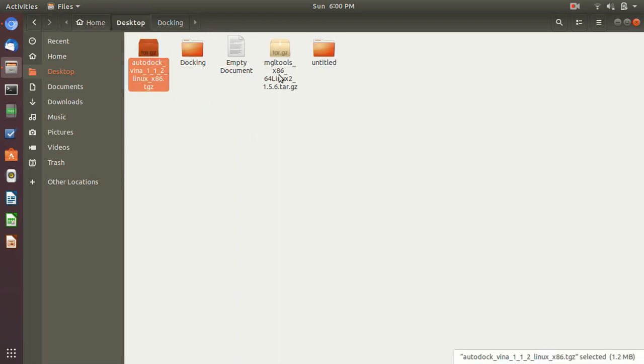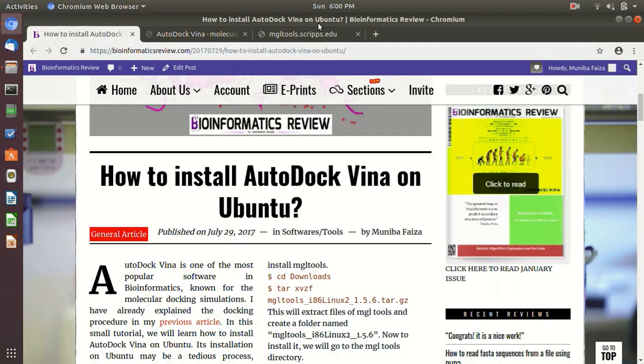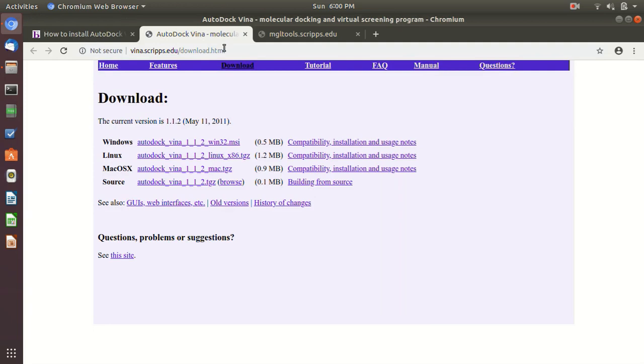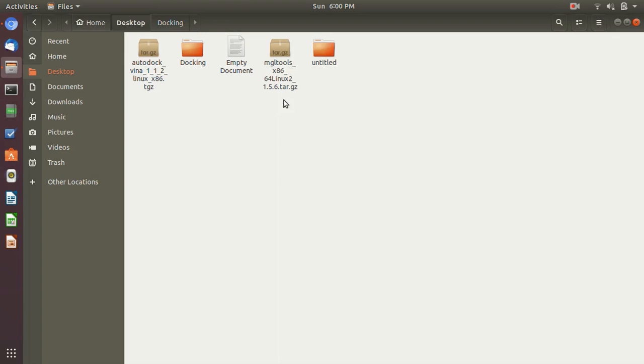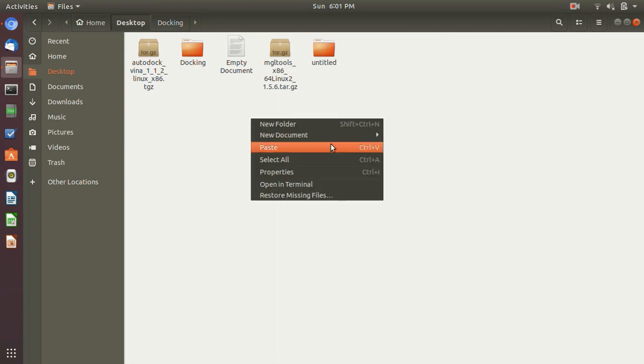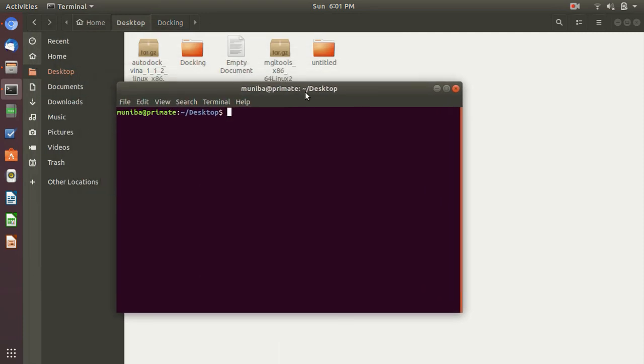So today, let's get started. As you can see here, I have already installed the MGL Tools and AutoDock Vina packages. If you would like to install them, at first you can install them from the website, or if you want to install them by a command line, so I will tell you how.